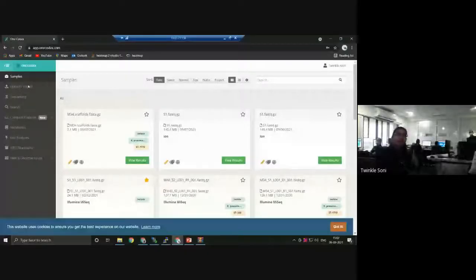So this is how it will look like. Over here, a name is there, upload and import.